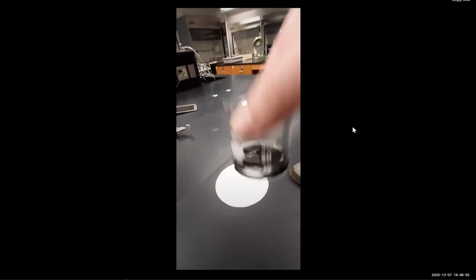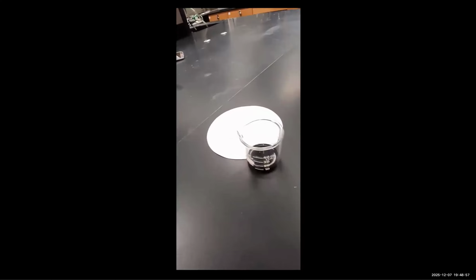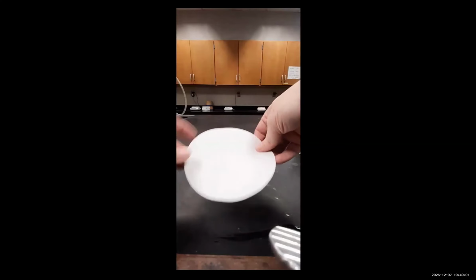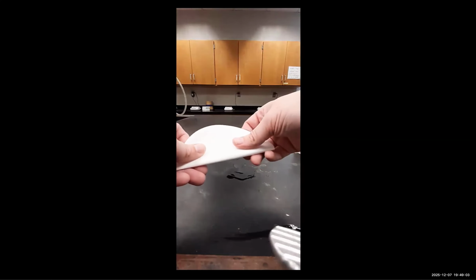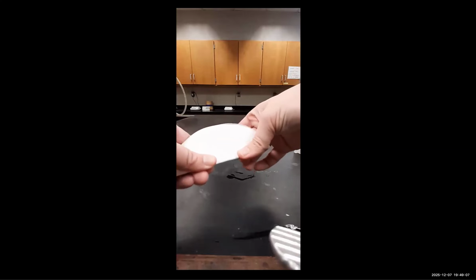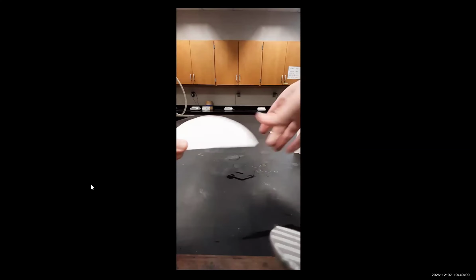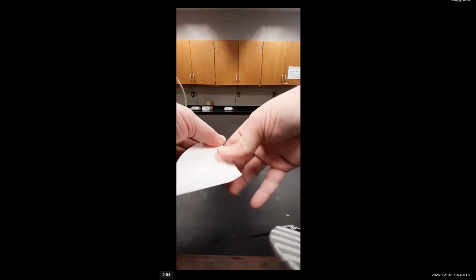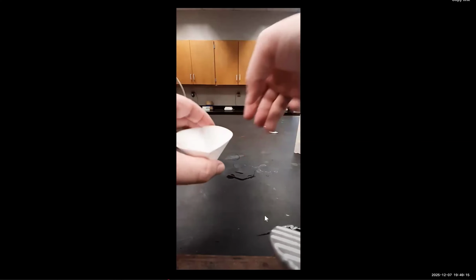So we're going to filter this mixture through a piece of filter paper. That filter paper is going to be folded so that it fits inside our filter funnel. Here we go.